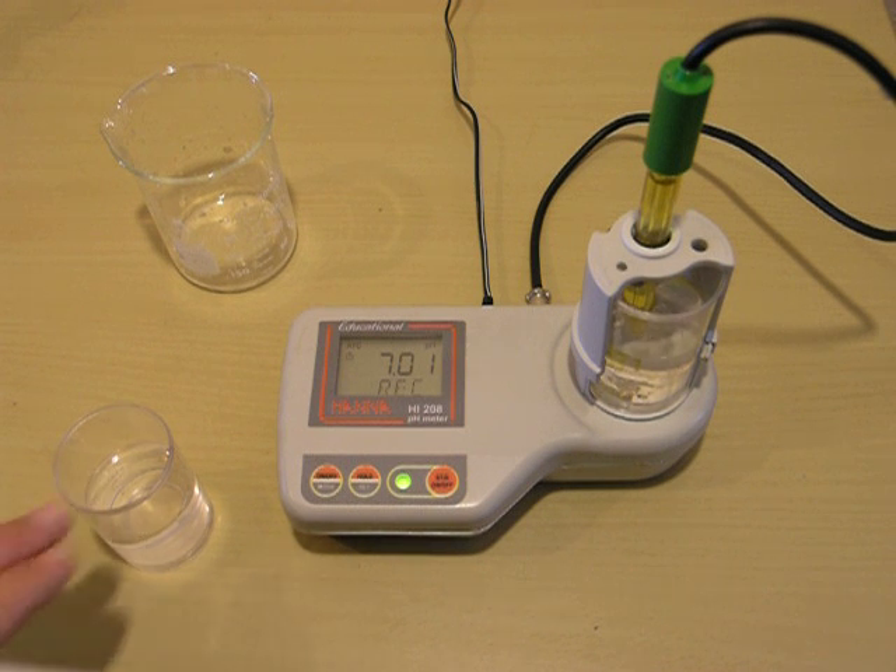I have my 4.0 buffer right here ready to go. Otherwise, you could empty out your beaker and then refill it with 4.0.